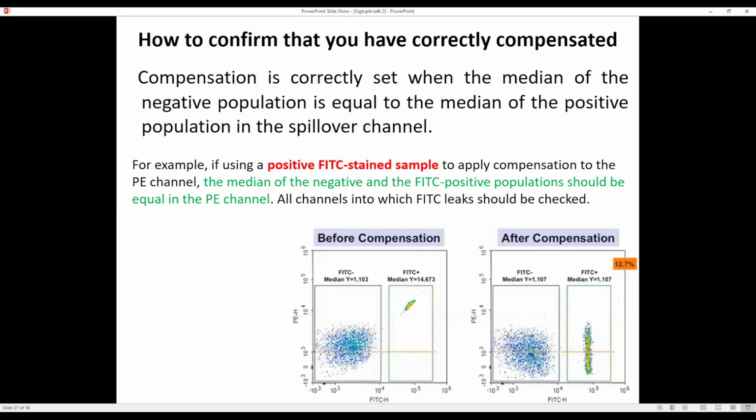Okay, there's a question on the chat. Yes. Sorry to interrupt you, Dr. Thulasi. No issues, please. There's another question. What about if using the same fluorochromes, but the processing is different? For example, cytoplasmic processing requires its own settings for comp.